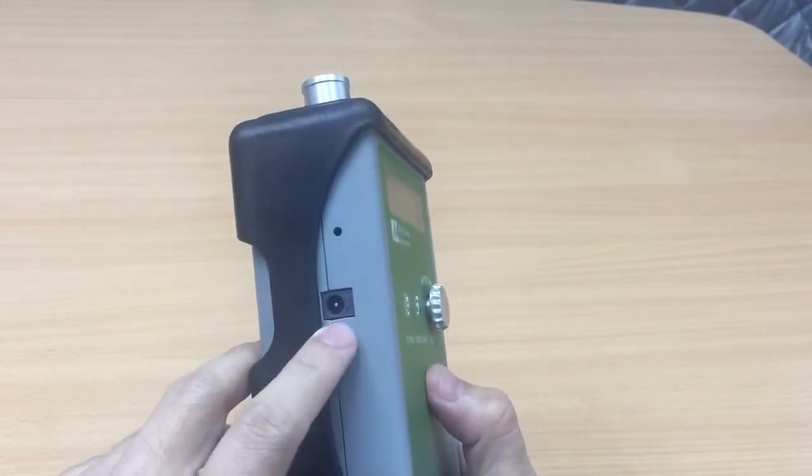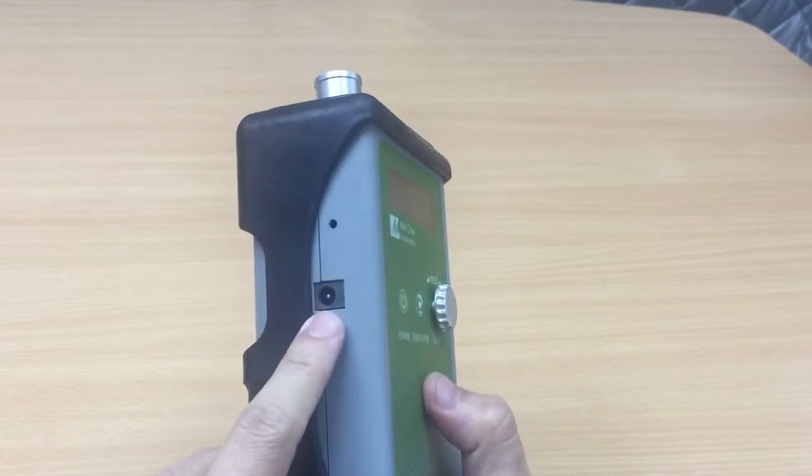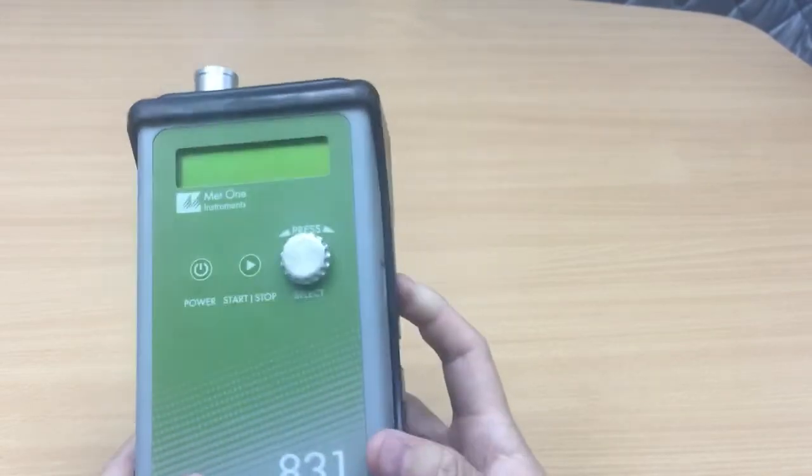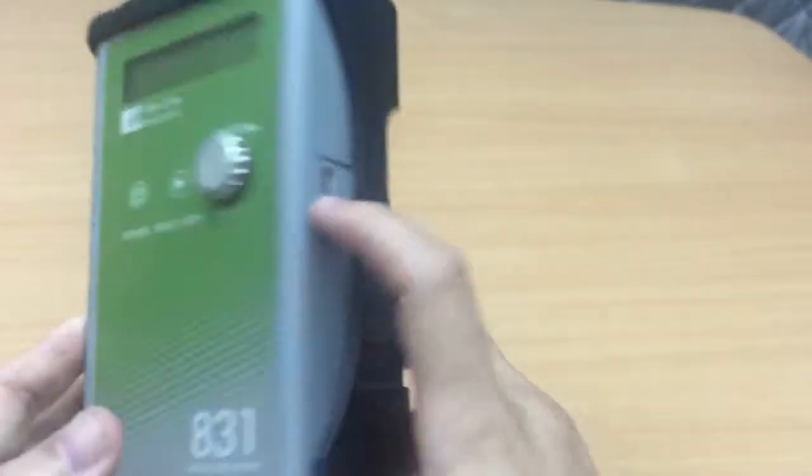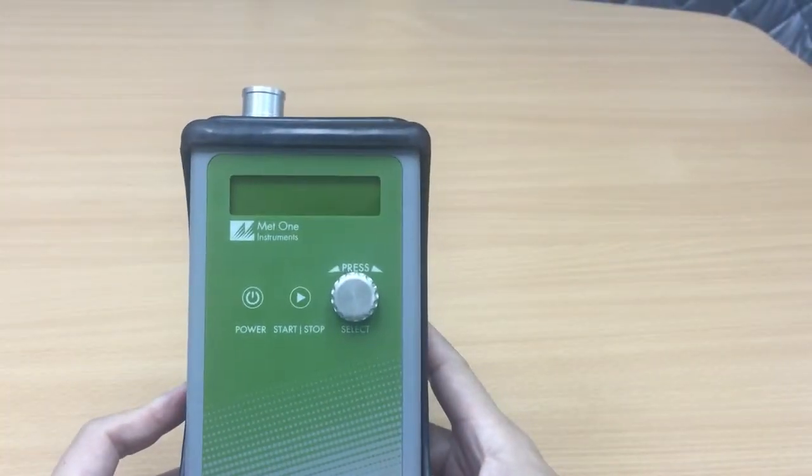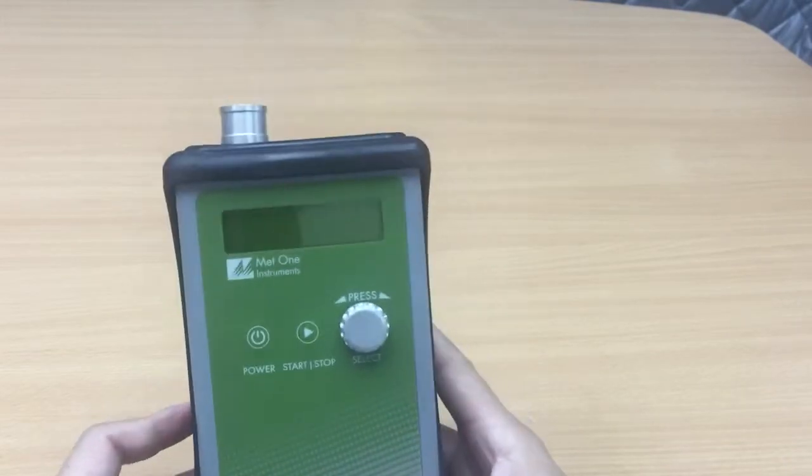So we have the DC jack, this socket over here for charging purposes and then we have a USB, a micro USB for downloading data. So the software when it comes with it we can download the instrument.